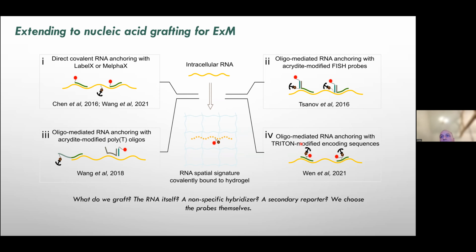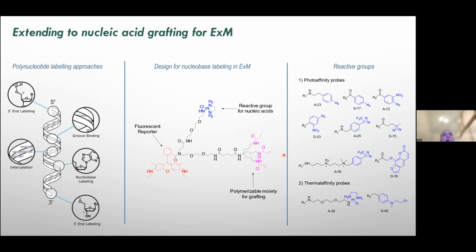But what we said is, let's bind the docking probes. Why? Because they will find your biological information and then be bound to the matrix covalently, and they will remain there forever. And then you're not depending on the length of the RNA or the structure of the RNA. So we tried to do this, and we came up with our design consideration.